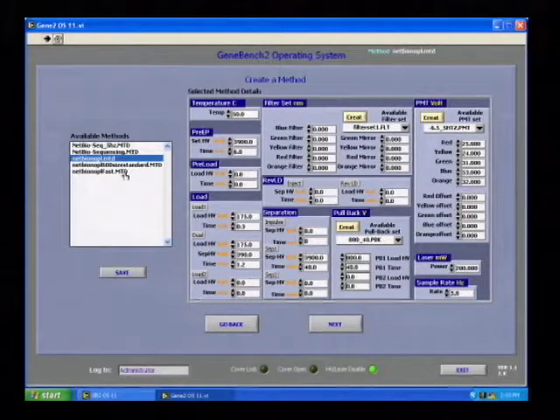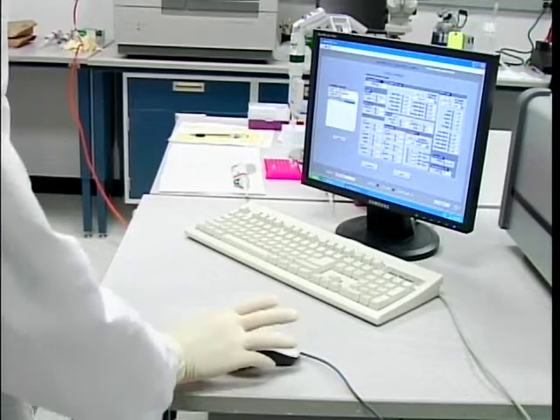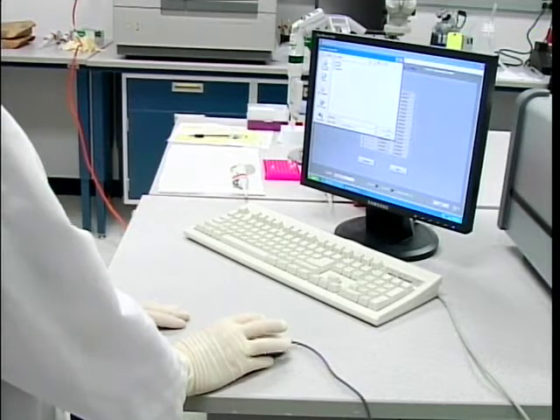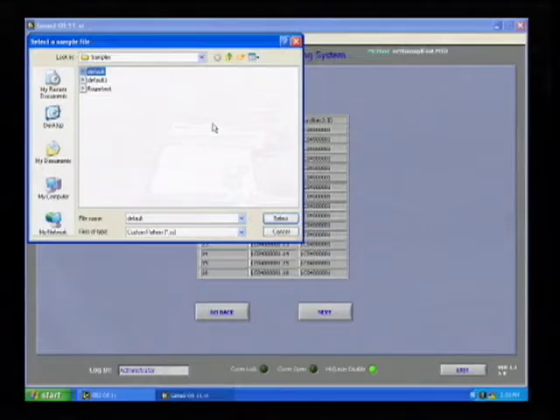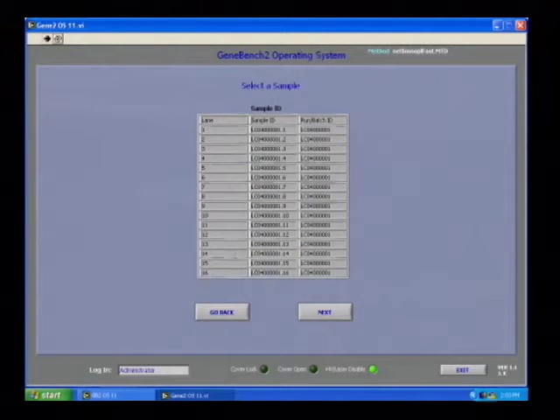The next page is the method file, which consists of a number of sections all pre-selected through a recipe for running. Specifically, one can select the temperature of operation, the injection conditions, the separation conditions, and the detection conditions. In normal operation, one would not adjust the method file parameters but rather just review them to make sure nothing has changed before moving forward.